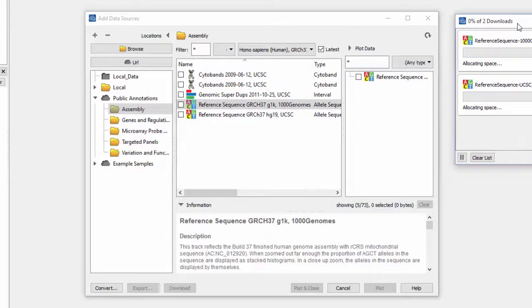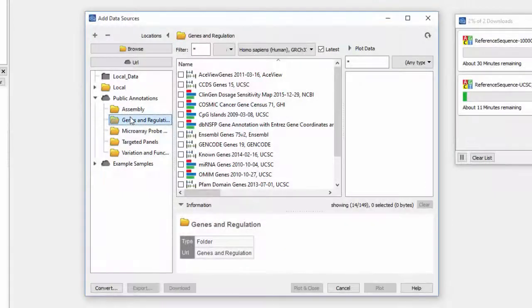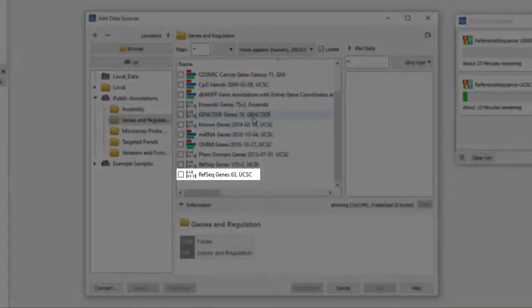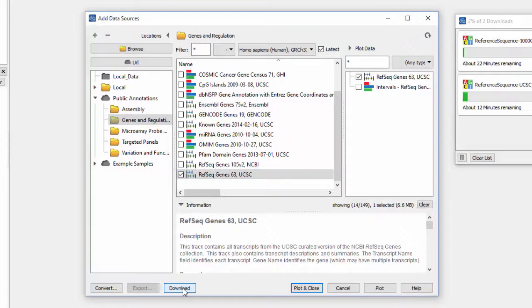Then go to Genes and Regulations, and select RefSeq Genes 63 UCSC, then click Download.